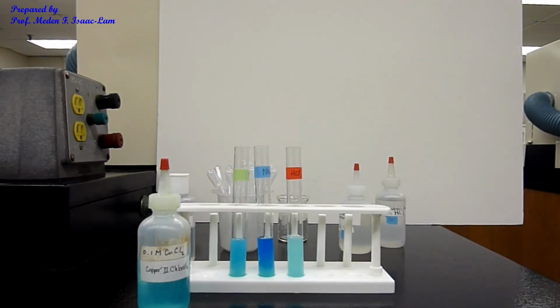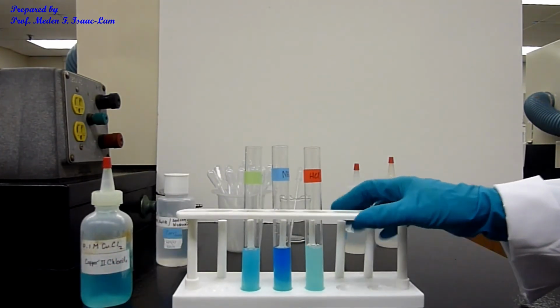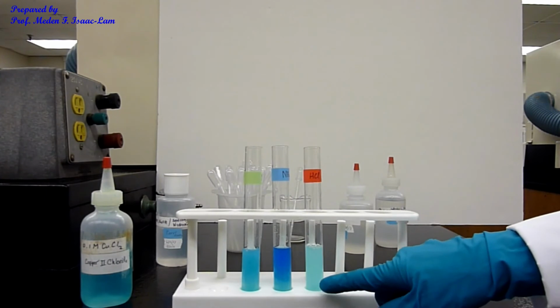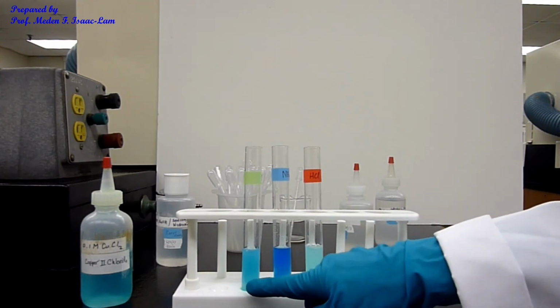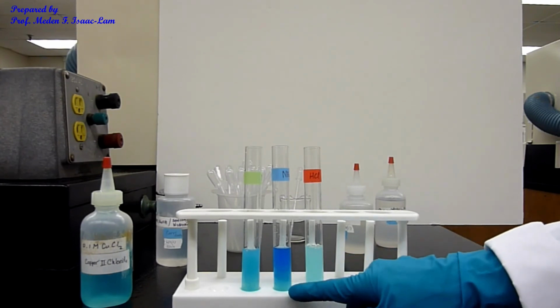So let it settle. So you can see that there's less precipitation on the hydrochloric acid. You have more precipitation on the sodium hydroxide as well as the ammonium hydroxide.